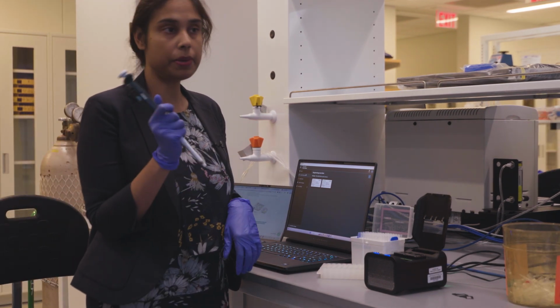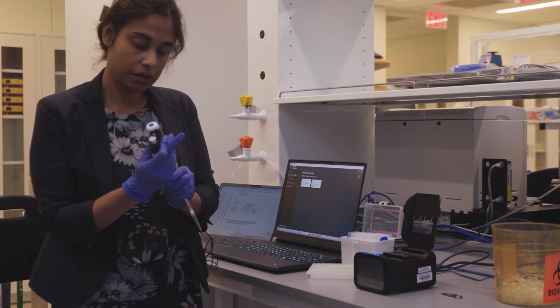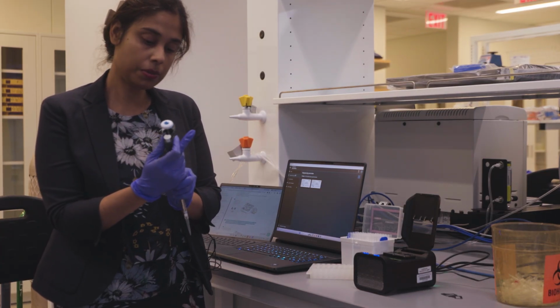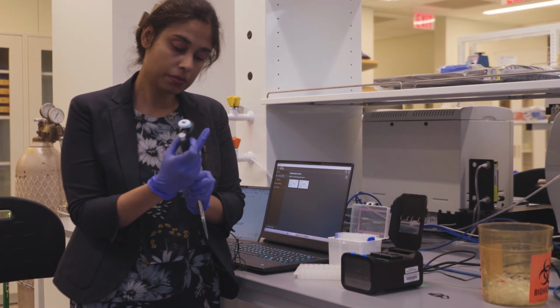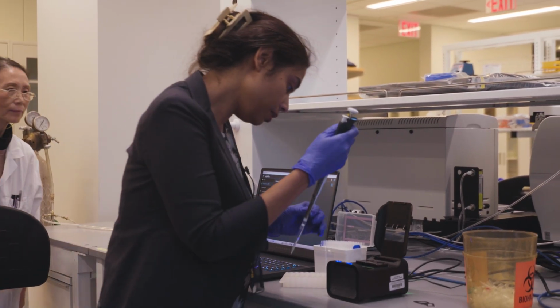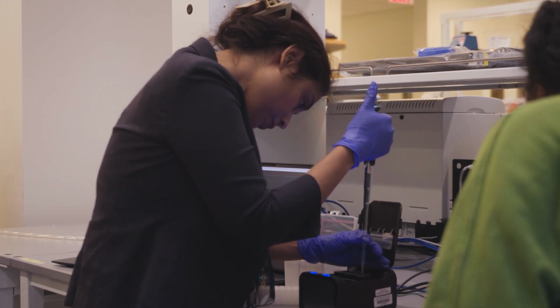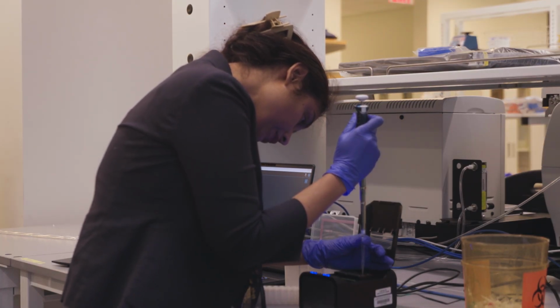Make it to 200 microliters, and then we are gonna take off the buffer upwards, like the buffer will come inside this tip. So let's see. The way I do it is you just put it here, and then here you can see it's coming up, right? So I'll just do a little bit more than this.